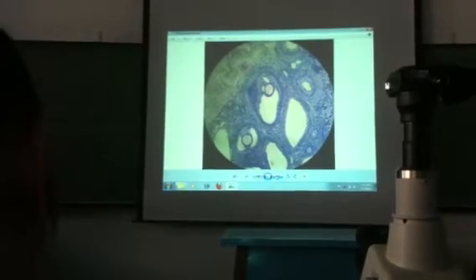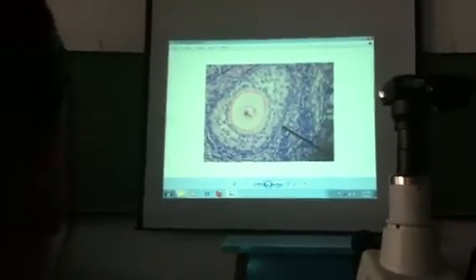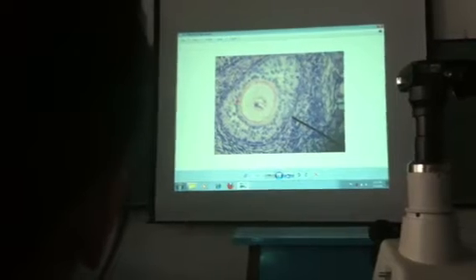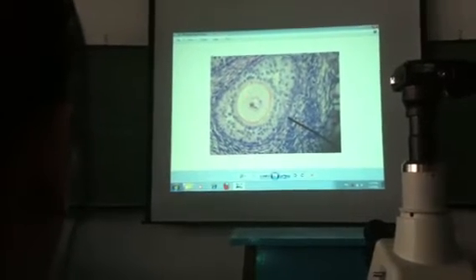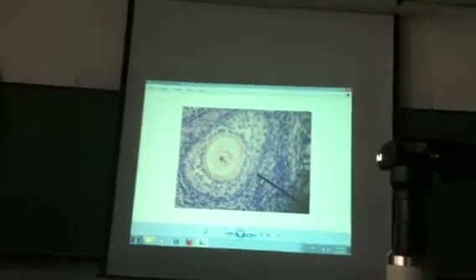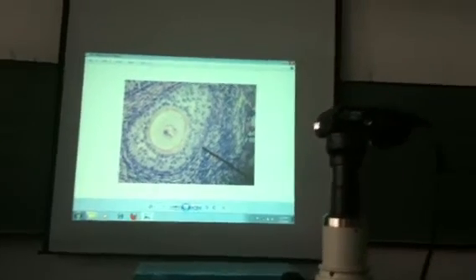So what can you see? What organelles can you see? Aside from the cell membrane, you have a zona pellucida that is similar to a capsule in other cells. It's like a capsule, the zona pellucida. You have the cytoplasm, which appears granular. You don't actually see endoplasmic reticulum or ribosomes, but the most prominent would be the nucleus and one or two nucleoli.